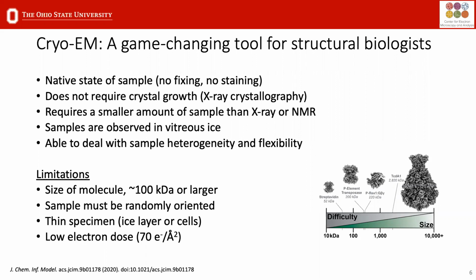And then also you have to be very aware of how to treat your sample and not to expose it to too much radiation and things like that. So that's just something to keep in mind in terms of whether or not your project would benefit from Cryo-EM.